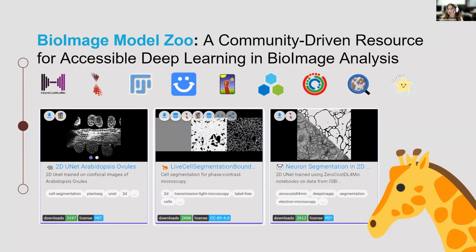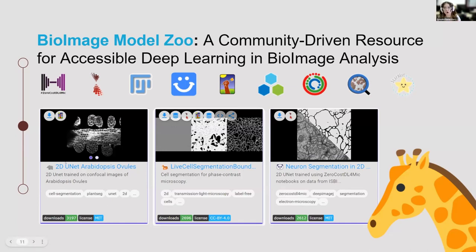We have a model card for each of the models, and each model card has one model inside. As befits a zoo, each model has the name of an animal together with an adjective — you can refer to the model by its name or by its animal identifier. We'll see this later.